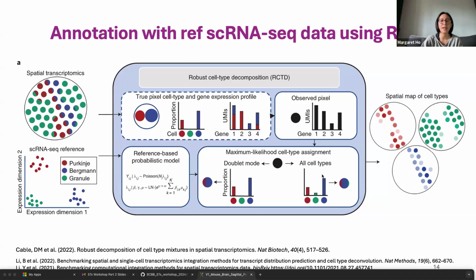I mentioned before that each Visium spot is going to encapsulate multiple cells. So in order to actually determine the cell identities that make up each spot, we have to use an appropriate reference single-cell RNA-seq data set. This will allow us to label each spot or cell in the spatial data set. And this whole process is called deconvolution.